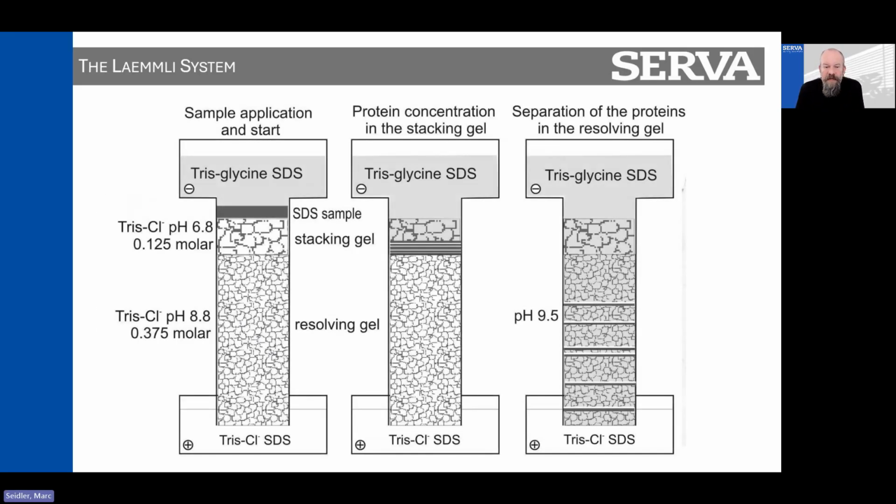Here is a picture of this Nature literature report, and you see maybe what you are doing all of the time in your lab. It is a buffer below and above, and then you have it seems like a gel with a huge pore size and small pore size. You have some pH here and molarities, and you have here the stacking gel and the resolving or the separating gel. This is what you might use all of the time, but we will go into a deeper look shortly.